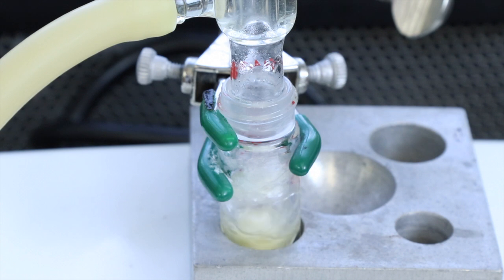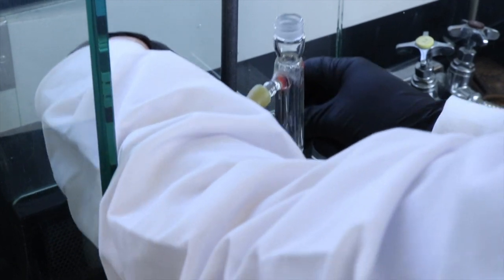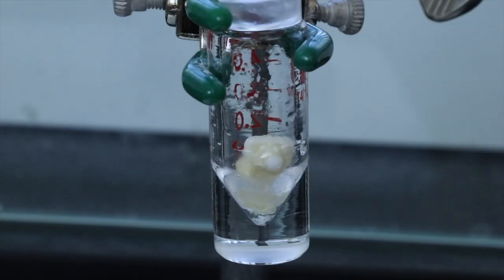And you can actually start to see the solid alcohol product forming here. You can see it in that kind of white pasty film on top of the liquid. Once the hour has passed, I'll lift everything off of the heat so the conical vial can cool. And here you can see the alcohol product gathering on the spin vane, and the acid product is going to be dissolved in the aqueous solution.